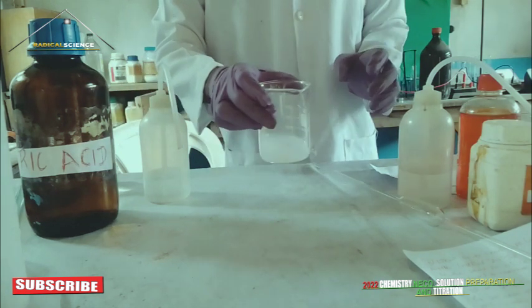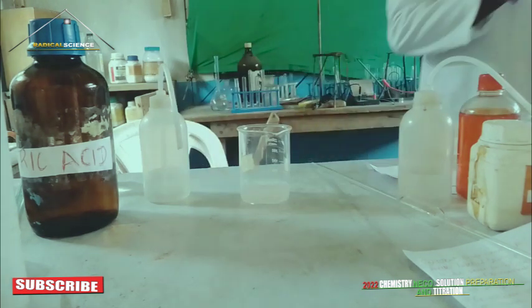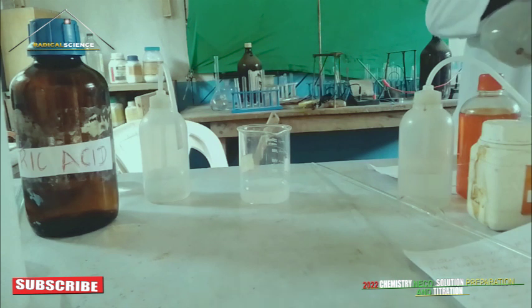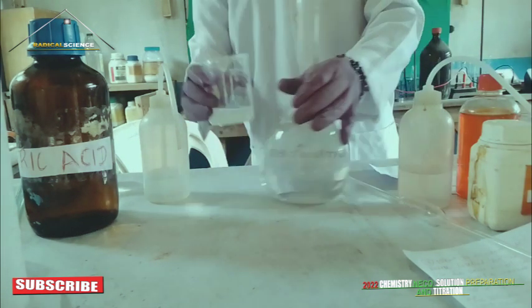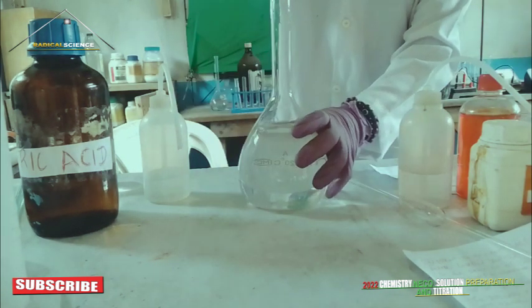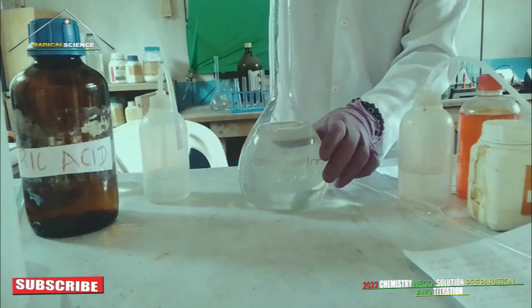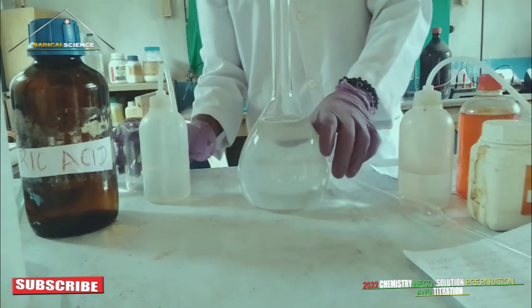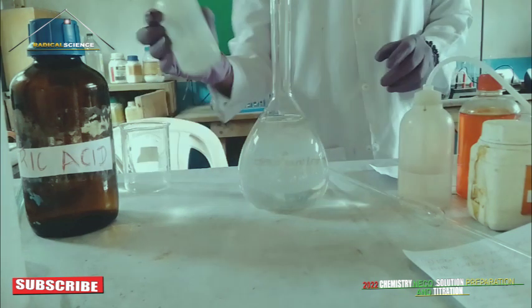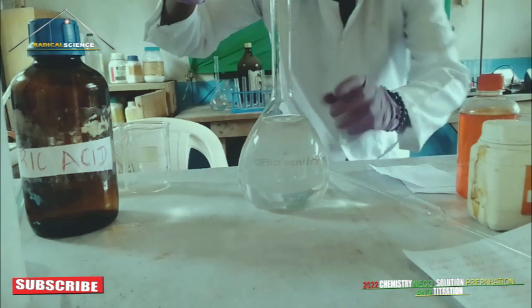After that, we go ahead and begin to pour it in. Next, we begin to add water.